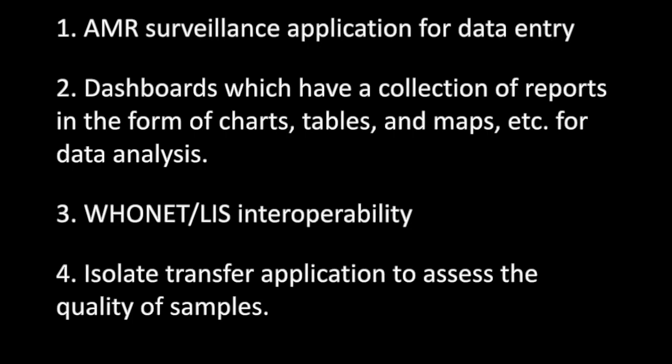The application has 4 components currently. AMR surveillance application for data entry. Dashboards, which has a collection of reports in the form of charts, tables, and maps, etc. for data analysis. WHONET and LIS interoperability. Isolate transfer application to assess the quality of samples.